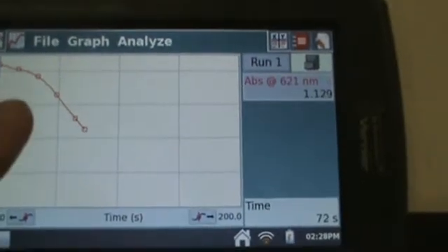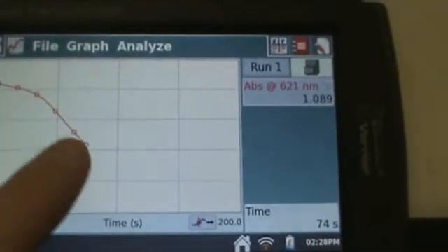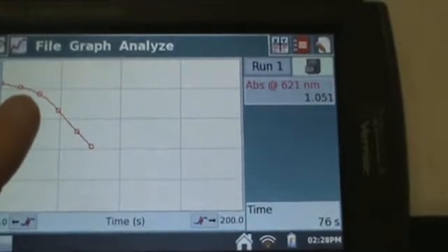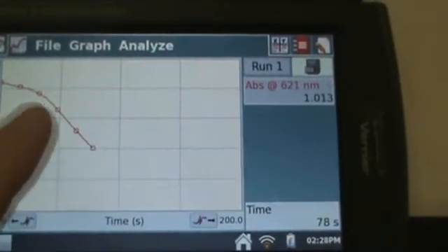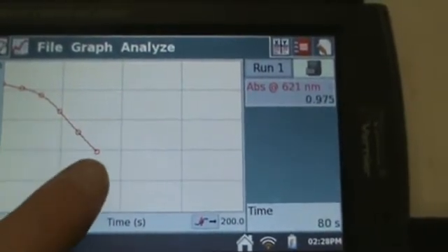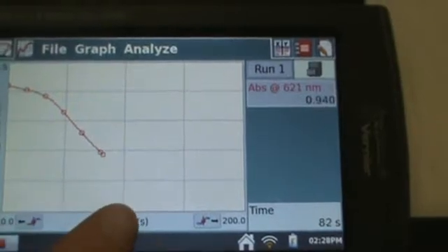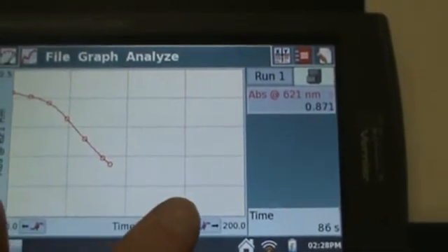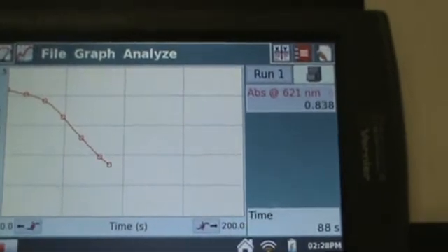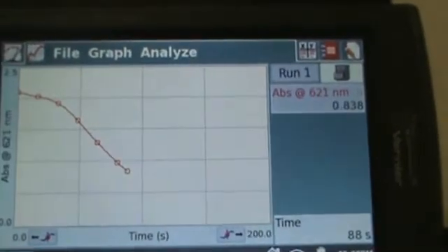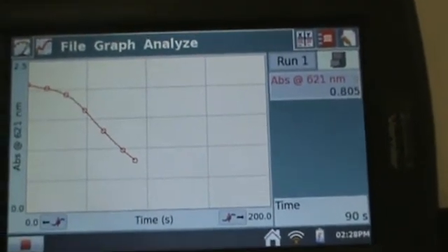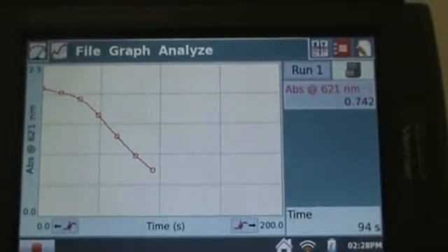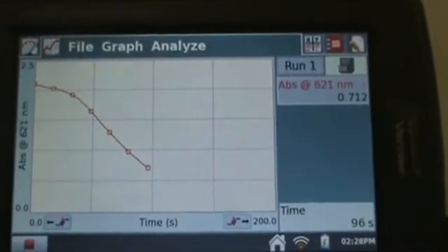Right here, from the last several seconds, we're seeing a pretty straight line. If that continues on, that's telling us we have a zero order reaction. But if instead it starts to slope and gradually change into a curve, that's going to tell us that we actually have a first or second order — or something different. Those are our most common, but it doesn't have to be those.